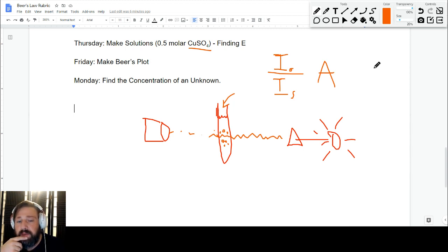So this is going to be pretty useful, because you can imagine if we have a huge concentration of our salt in here, what's going to happen to the absorbance? If we have a lot, that means we're going to have more light being absorbed. So in terms of our concentration, if our concentration goes up, the absorbance also goes up. So that's great. Awesome. That's pretty cool.